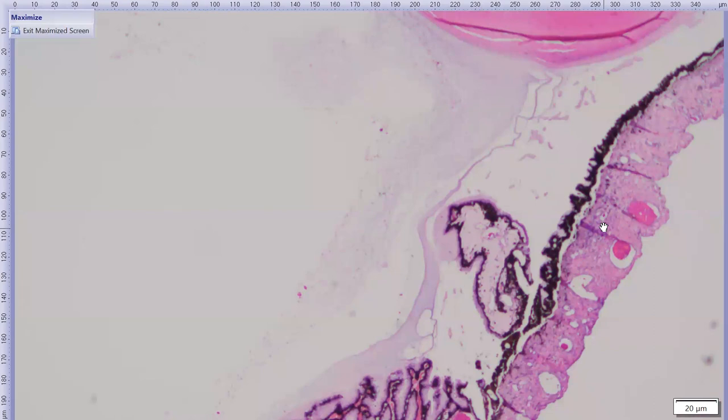So these signs, the anterior angling of the ciliary body plicae, the narrowing of the iridocorneal angle, and the anterior prolapse of the anterior vitreal face, are basically the only histologic findings we have to make a diagnosis of aqueous misdirect. Aqueous misdirect overall, though, is a diagnosis of exclusion. Basically, you need to make sure that there aren't other causes of glaucoma in this cat before you can make that diagnosis or suggest that as a differential. In this case, we did suggest that as a differential.